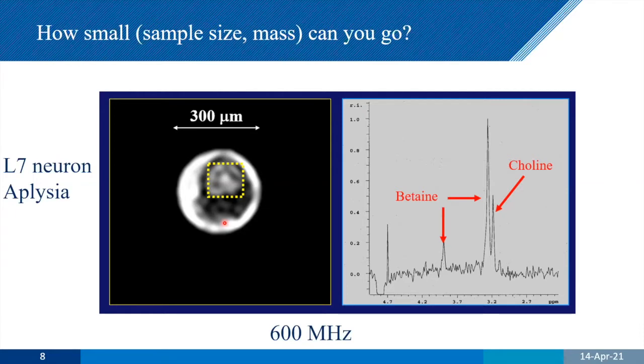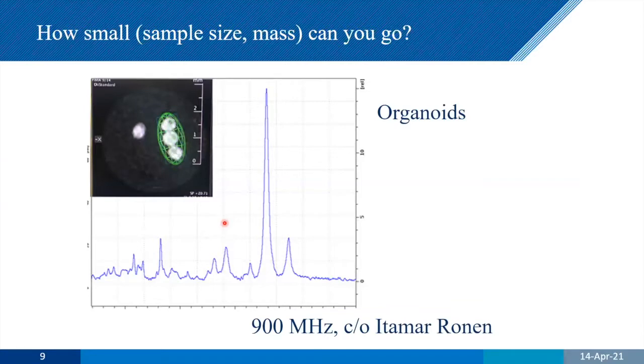And so here you can see within the nucleus of a single cell, taken within 8 minutes here, you can get ideas about the concentrations of biochemicals in there. And you can see what happens when you give challenges to that. You might give ultraviolet light, you might give chemical challenges to this, and we can see what's happening to the intrinsic biochemistry. And we're continuing this work.